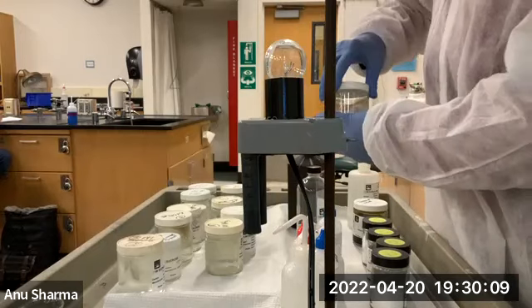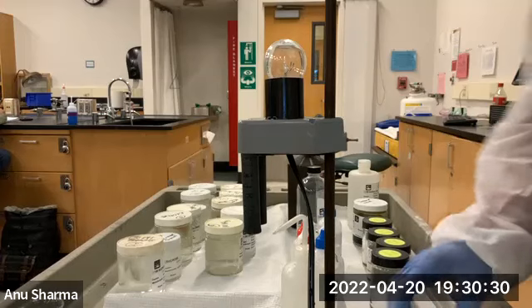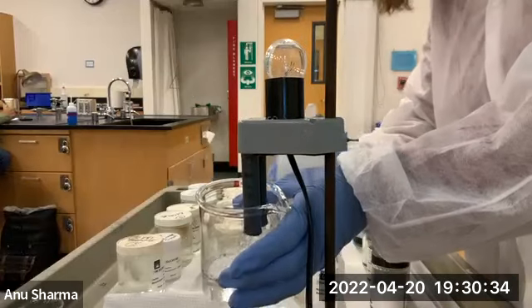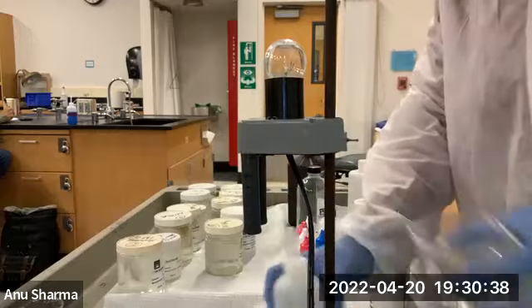Here we have the ammonia with acetic acid. Conductivity before mixing is weak conductivity, or weak electrolytes. Conductivity after mixing is a strong electrolyte. Because ammonium ions and acetate ions break up in the water, right? And so basically that's why they are able to conduct electricity completely.